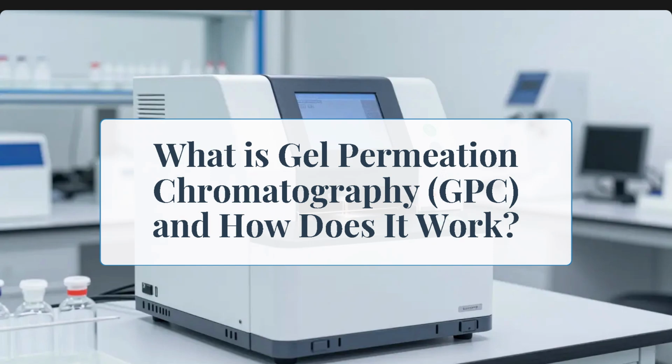Let me start with a simple question. If you create a polymer in the lab, how do you really know what you made? Not just the chemical structure, but the size of the molecules. Are they all uniform, or is it a mixture of long and short chains? That's where gel permeation chromatography, or GPC, becomes essential. Today, I'll walk you through what GPC is, why it matters, and how it helps us truly understand polymer materials.